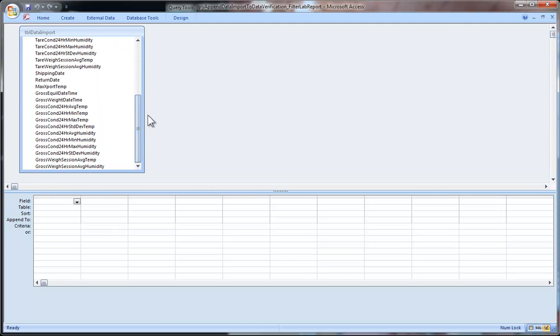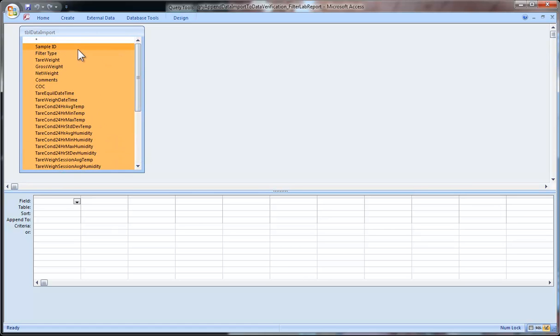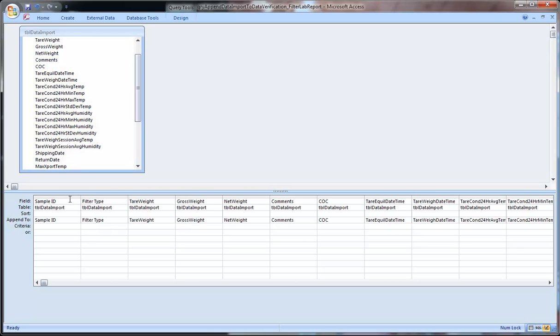I'm going to pull this grabber bar down. I'm going to hold down my shift key and click on the last one, just like anything else in Windows that selects all of them. And then I'm going to pull them down. You can click anywhere in the selected orange area. Hold your cursor down and click and pull the whole set down, and then release your mouse click, and then they get mapped into what the toolbox thinks they should be.